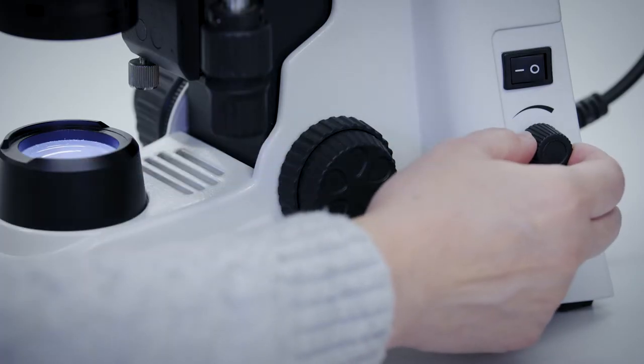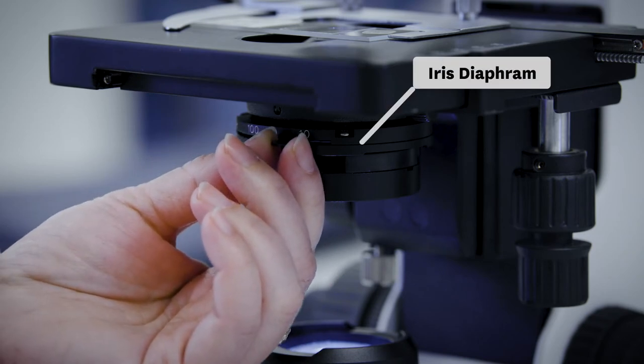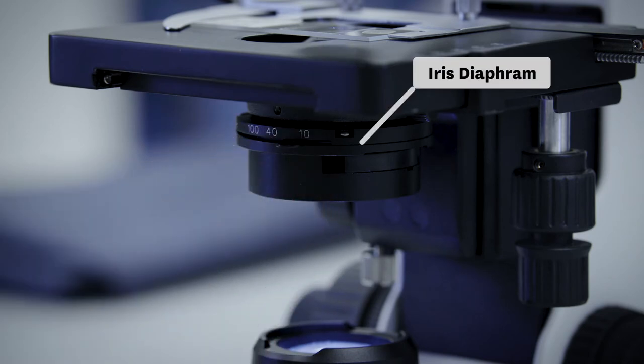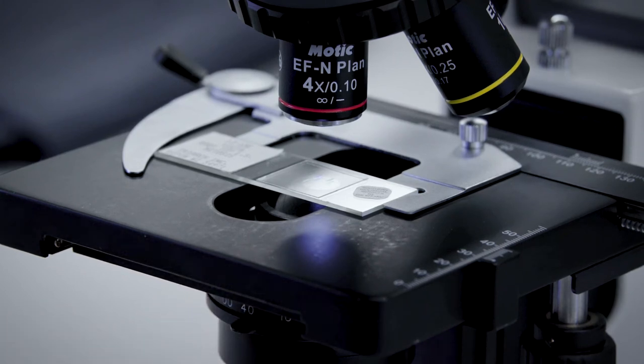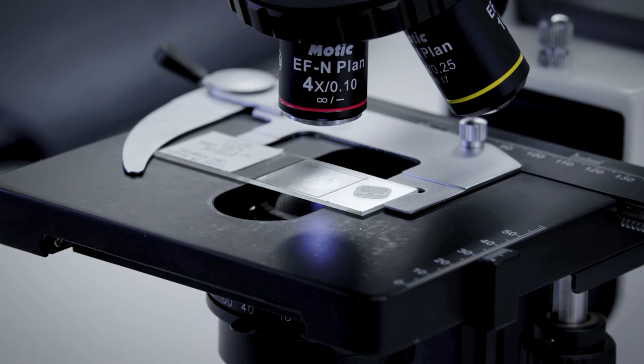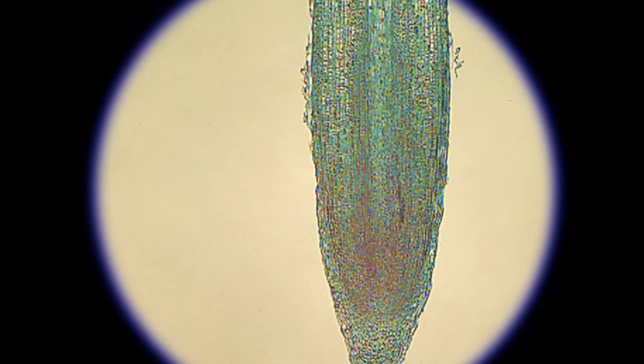You can adjust the light intensity with a light dial or with the iris diaphragm on the condenser. The lever on the condenser is used to open or close the iris diaphragm which controls the amount of light from the light source to the slide. Adjust the light until it gives you the best image.